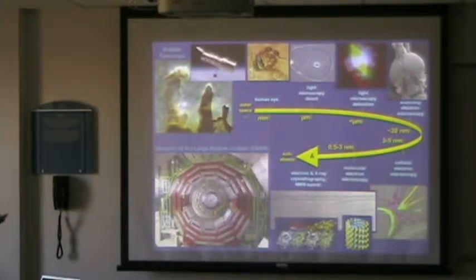We really don't do scanning electron microscopy here in the facility, but some people do it at CU. We mostly do cellular electron microscopy and molecular electron microscopy. So that's about our domain here, which is intact cells, entire cell structures, and large molecular assemblies like these microtubules, docked in these particular cases with molecular motors, and we do a little bit of atomic interpretation of these things if that's possible.